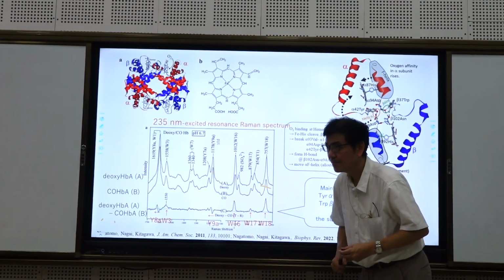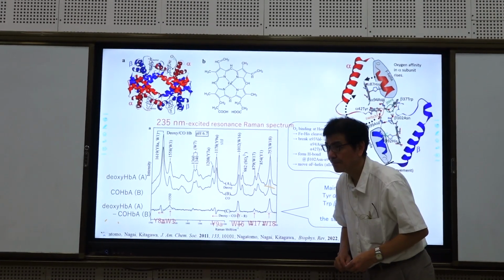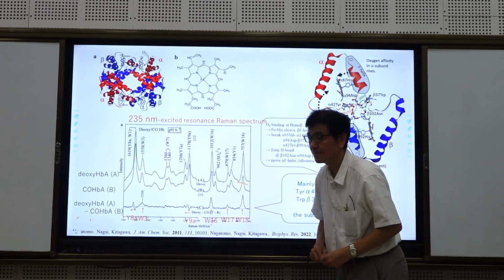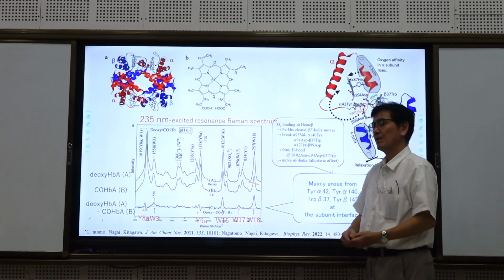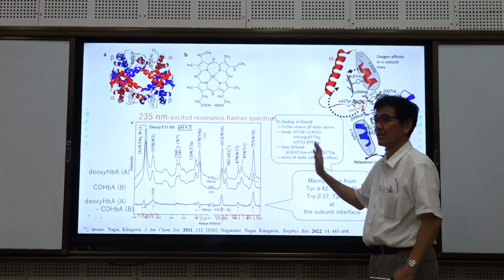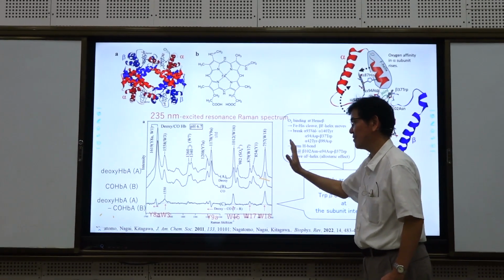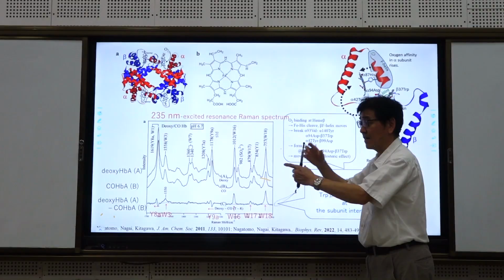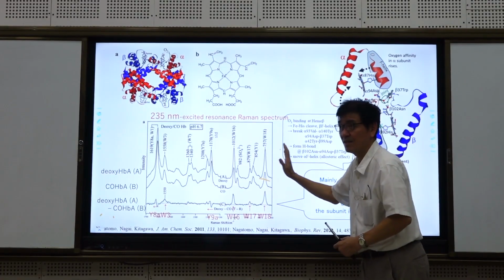For example, a dye absorbs at 520 nanometers. Is it good to take 532 nanometers as the excitation source? If the absorption is near 500 nanometers, you put in a crystal and change the wavelength to approach it.